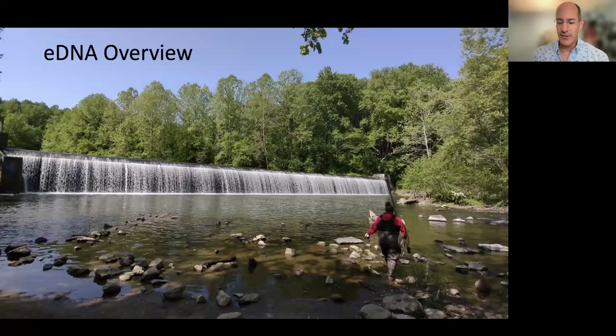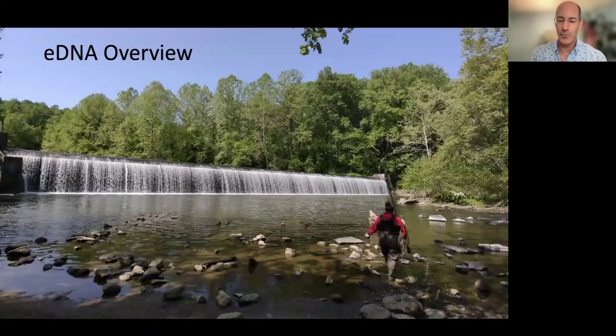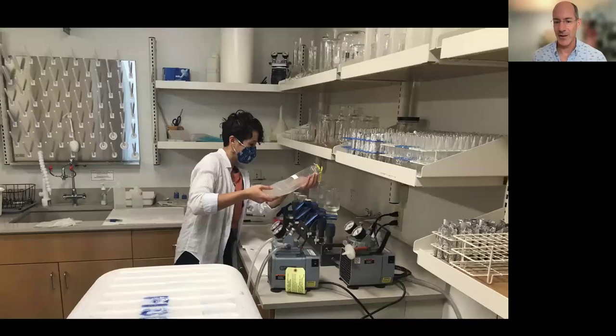But basically what this looked like is going out into the field and scooping up some water in a bottle, or in this case, a plastic bag. They need to be sterile so that you're not transferring DNA from one sampling site to the next, or mixing in a bunch of human DNA, or other things.